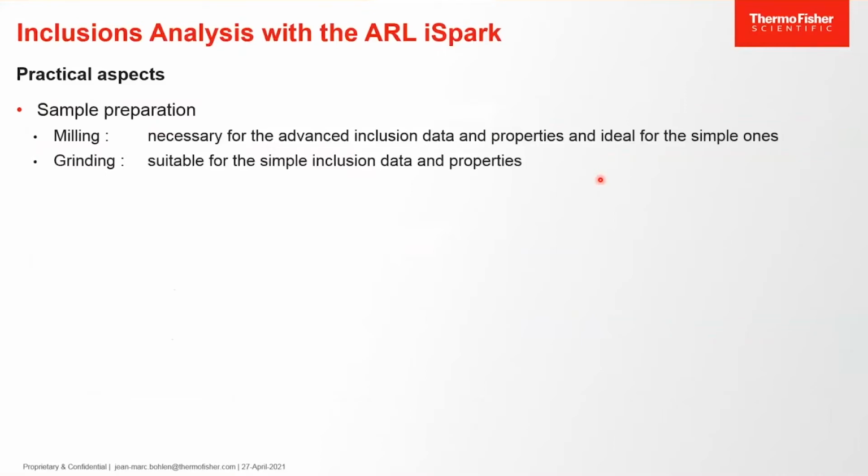As you know, milling is recommended in many cases. And it is the case also for the inclusion analysis when advanced inclusion data and properties want to be evaluated. It is also, of course, the best choice for the simple data and properties.